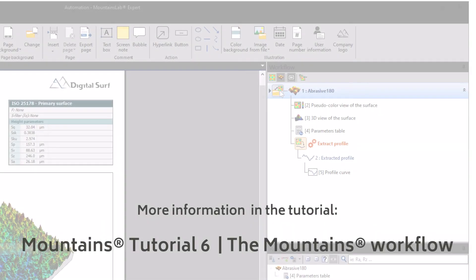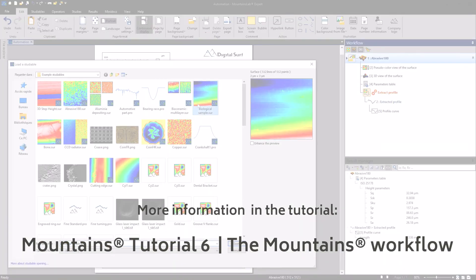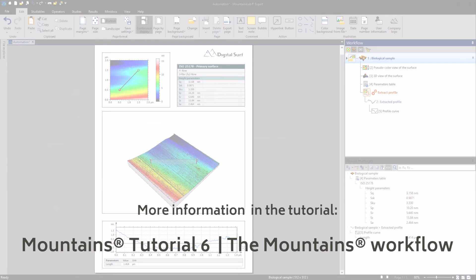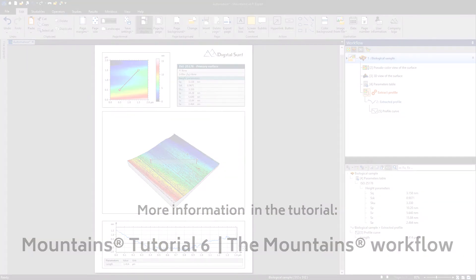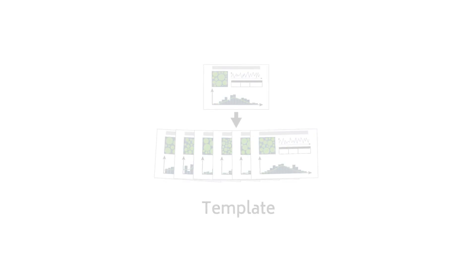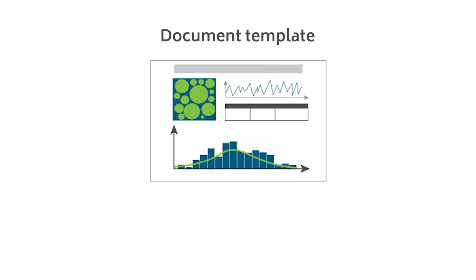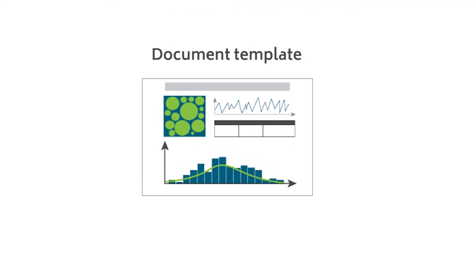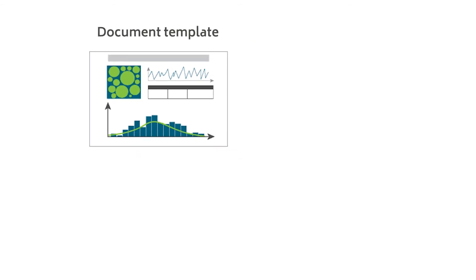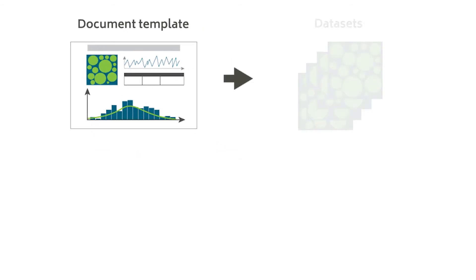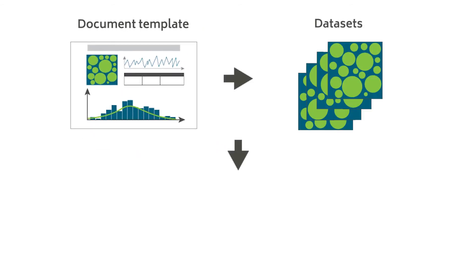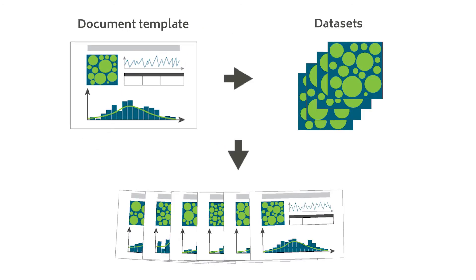The Mountain's workflow also provides powerful automation features. A useful tool for automated reporting is the Mountain's template feature. Say I wish to apply the sequence of analysis steps in this document to several other data sets.